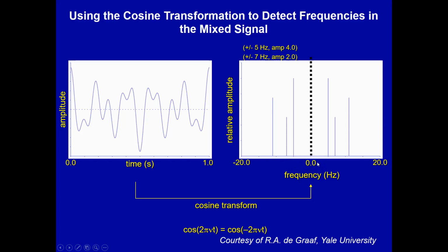You can have some magnetization that precesses clockwise and some that precesses counterclockwise, because its actual precession frequency is a little bit faster or a little bit slower than the Larmor frequency. So this frequency axis is actually frequency relative to what we call the carrier frequency, or the Larmor frequency, this rotating frame. The reason these mirror images exist is that all we have is one trace. We can't tell if this trace came from something that's rotating clockwise or counterclockwise.